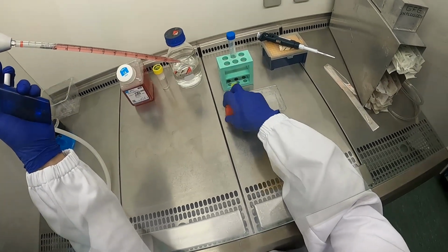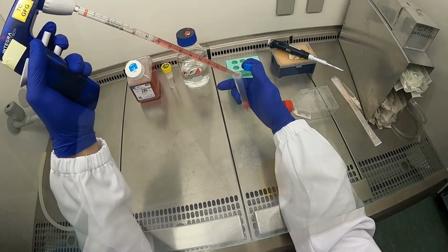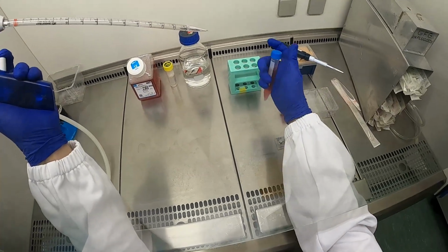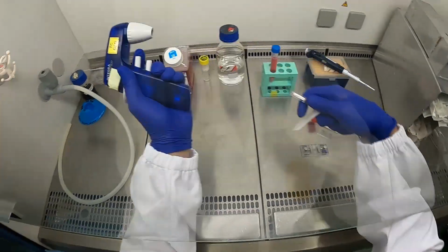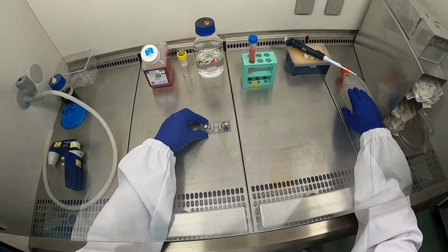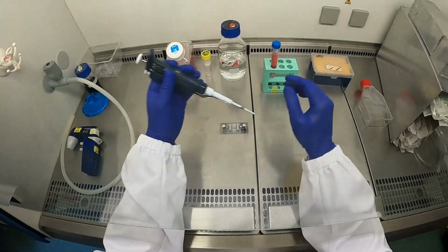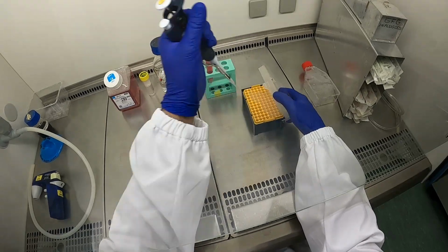So let's transfer all the cells into a tube. Throw away the pipette. And now it's time to count the cells. In order to cover this counting area in the hemocytometer, we need roughly 10 microliters.